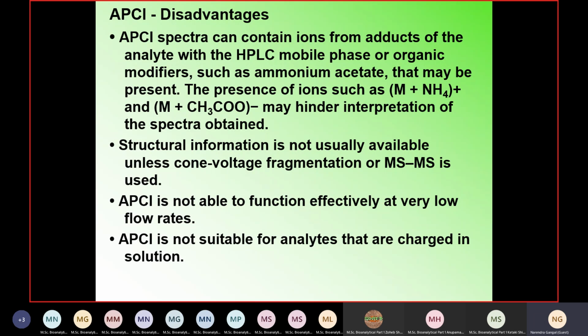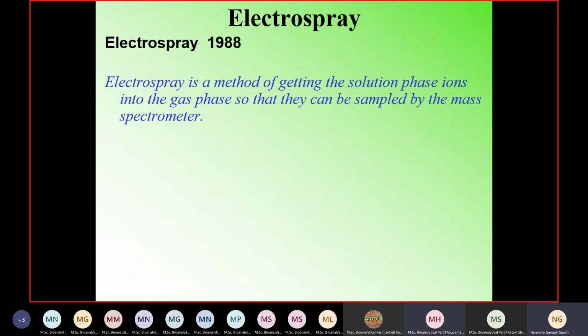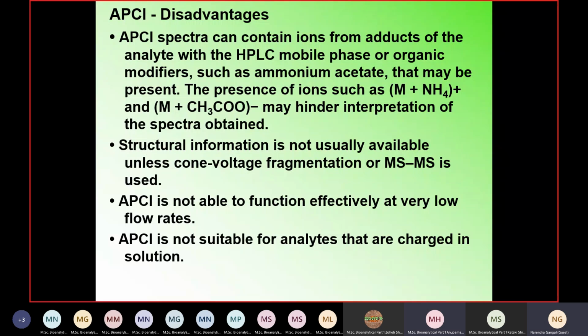It is also not a very suitable technique for species which are already charged in solution, because I do not want solution charge. I want the solvent to charge my species or the solvent to form my ions. Are these things clear? Yes, sir. Okay, so now we'll stop here.